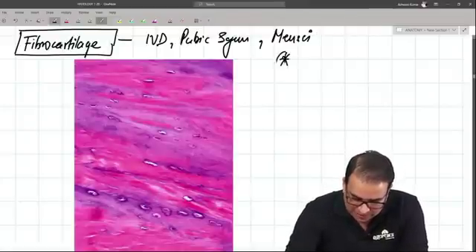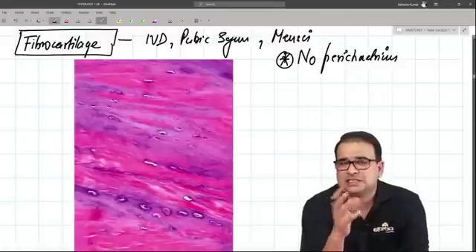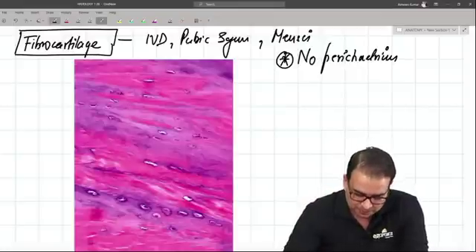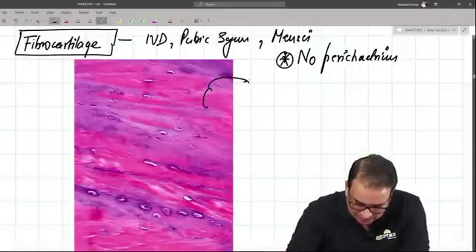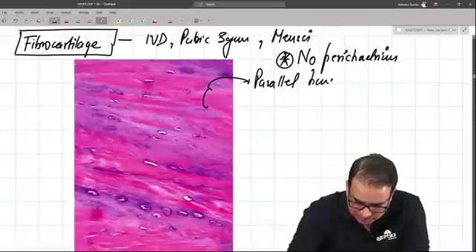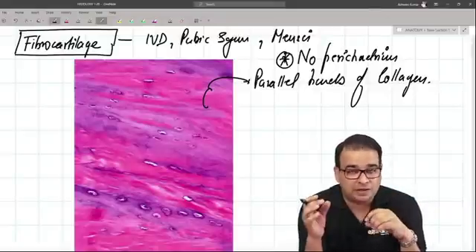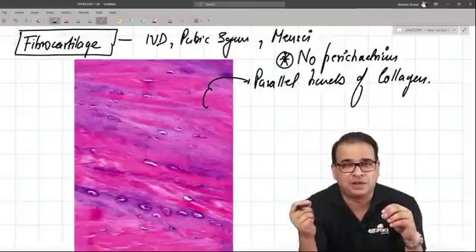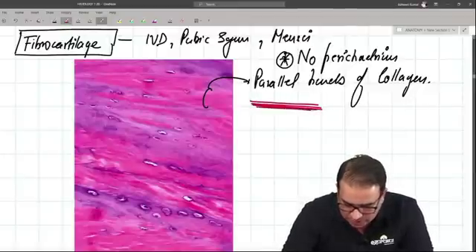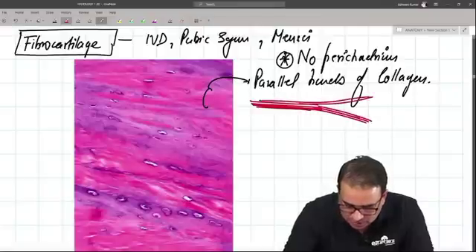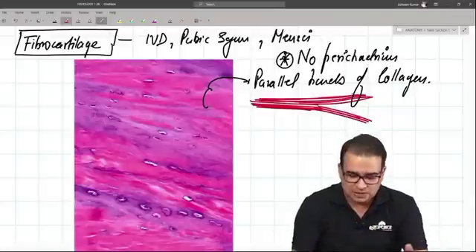What you see in fibrocartilage that is different from hyaline cartilage: first, there is no perichondrium at all — in hyaline cartilage the exception was the articular region, but in fibrocartilage there is no perichondrium. Also, there are no cell nests. What you notice instead are these parallel bundles of collagen fibers, showing bundle branching — where a bundle may split so that some fibers run in one direction and the rest in another. It is not individual fiber branching, but bundle branching.